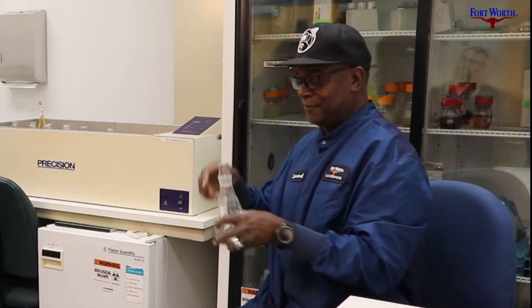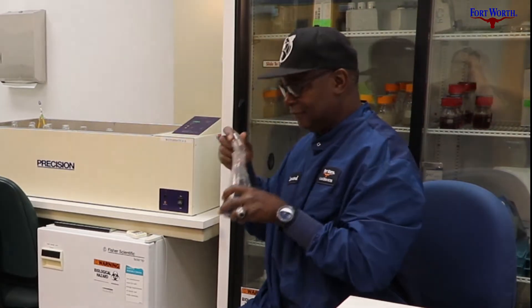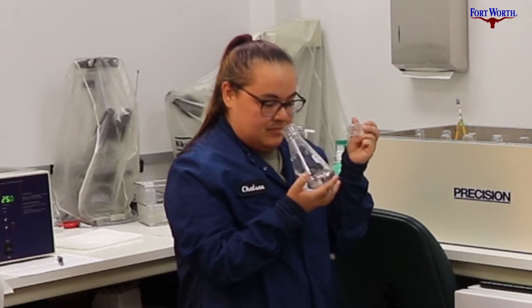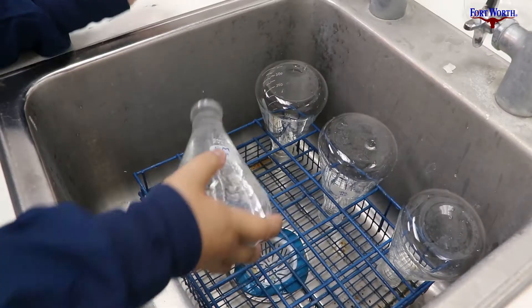Our samples we heat up to be able to smell the odors. When the water is cold you're not able to smell any odor vapors coming off of it.